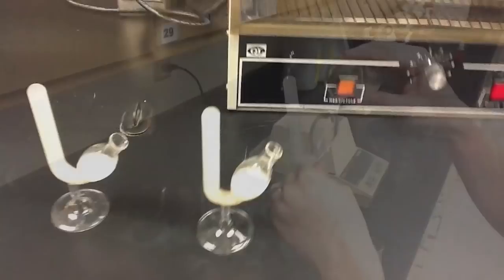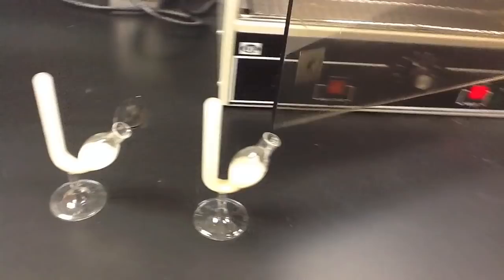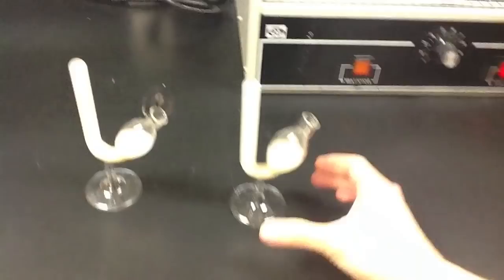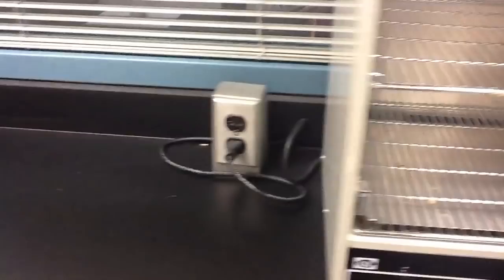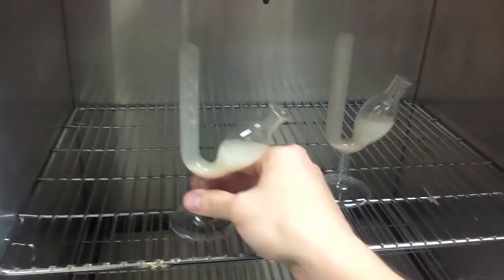After taking the initial reading for the amount of carbon dioxide produced in both solutions, we're now ready to place the fermentation tubes into the incubator. Simply place them on the rack, and we close the door, and we will now let them incubate for a total of 40 minutes, checking them at 10 minute time intervals.